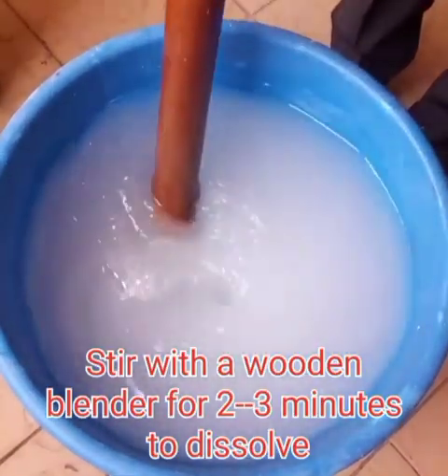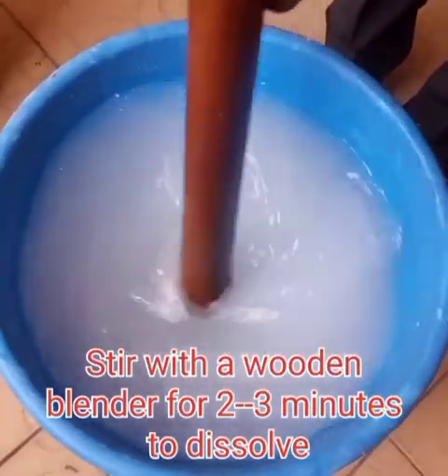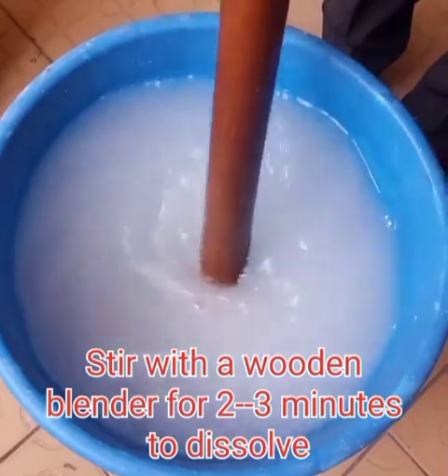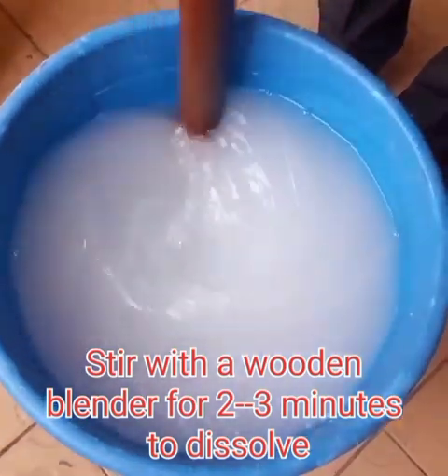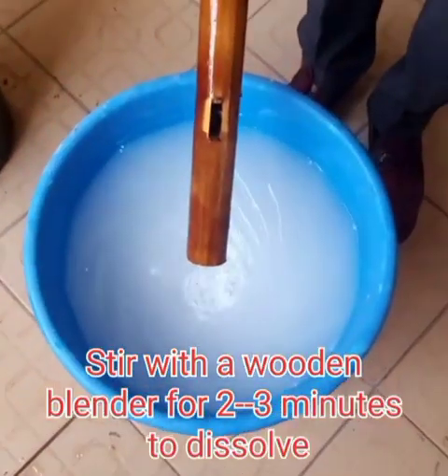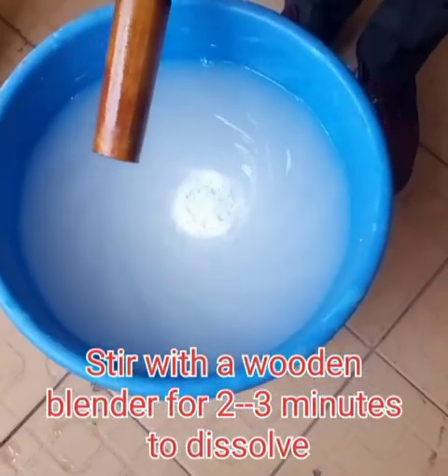Stir it to dissolve. It doesn't take time to dissolve. As you can see, it's dissolving. The caustic soda is dissolved in water.